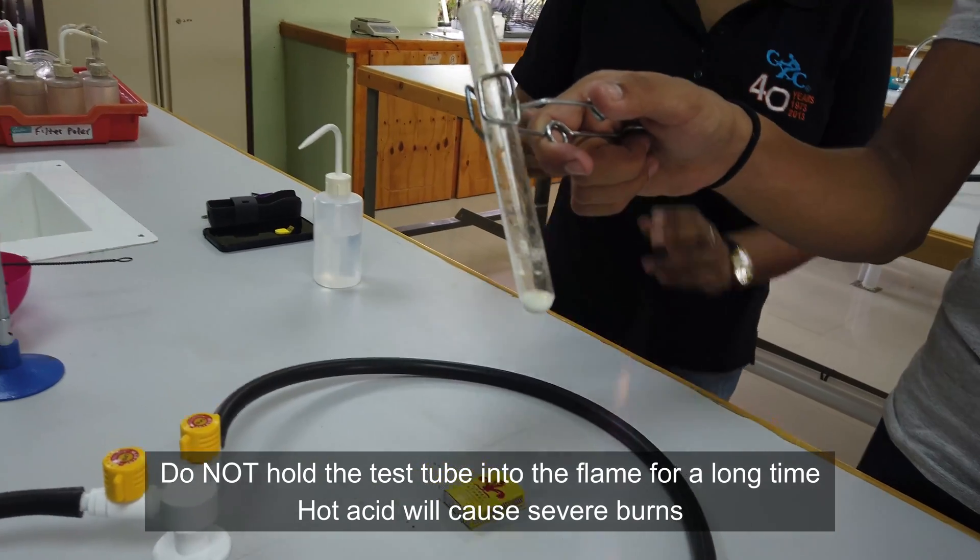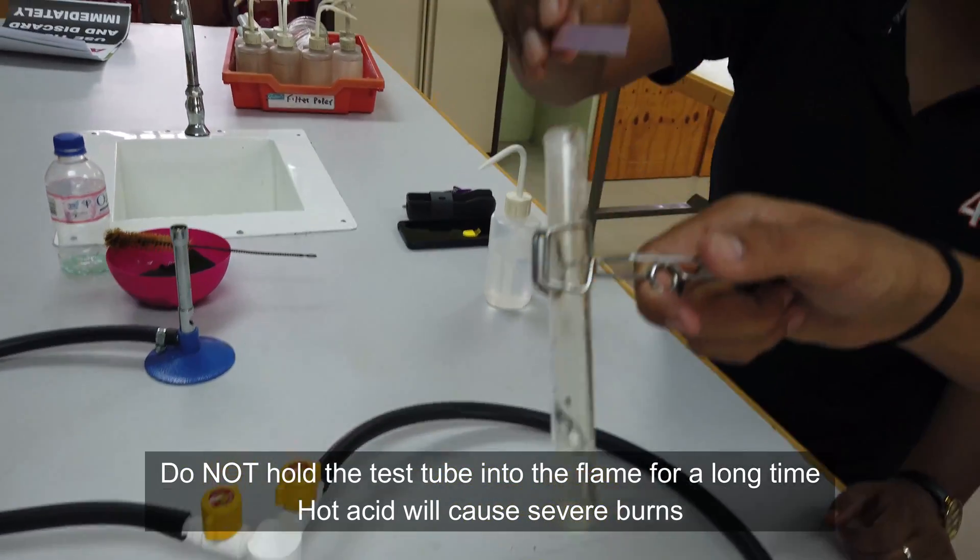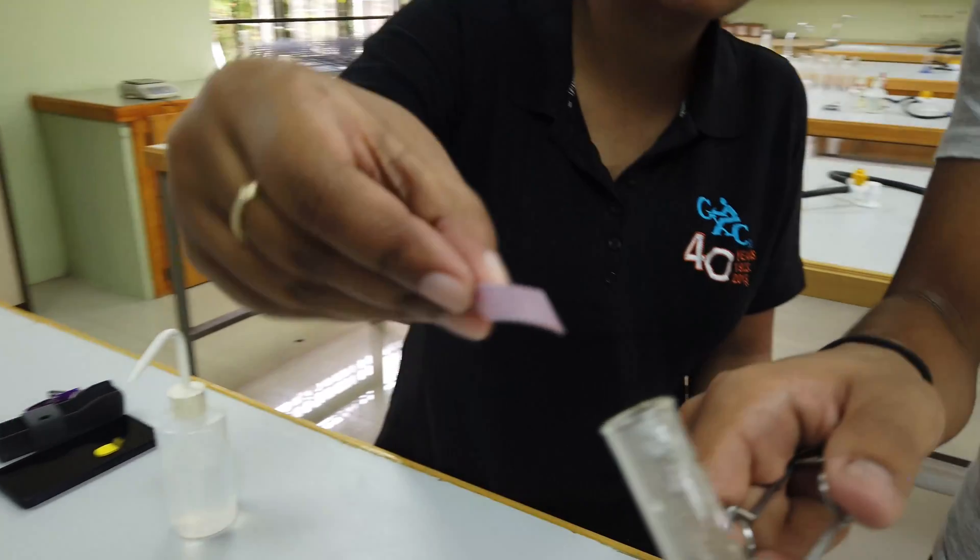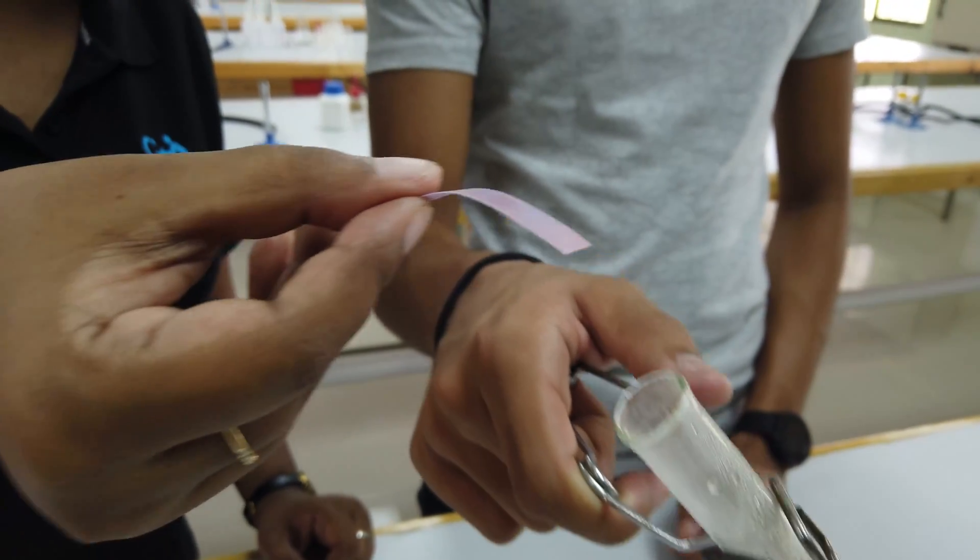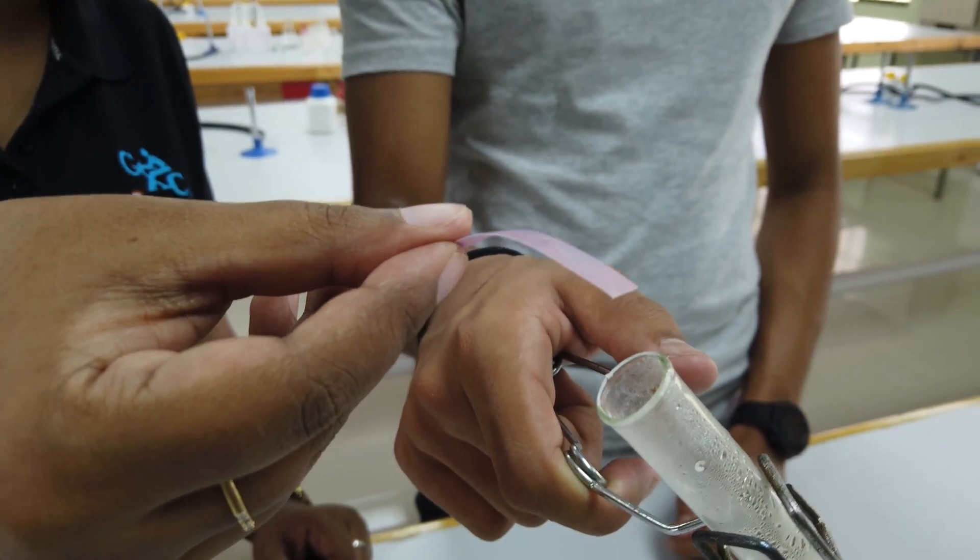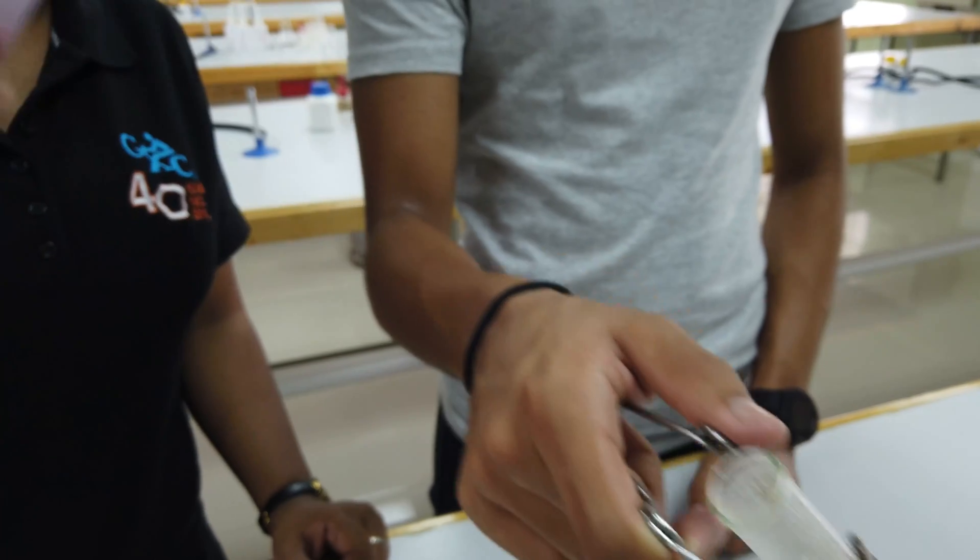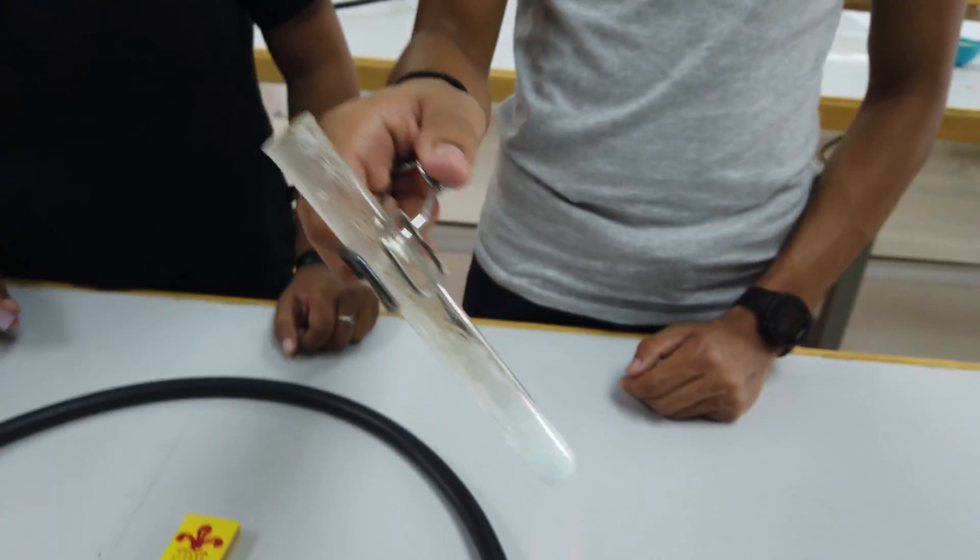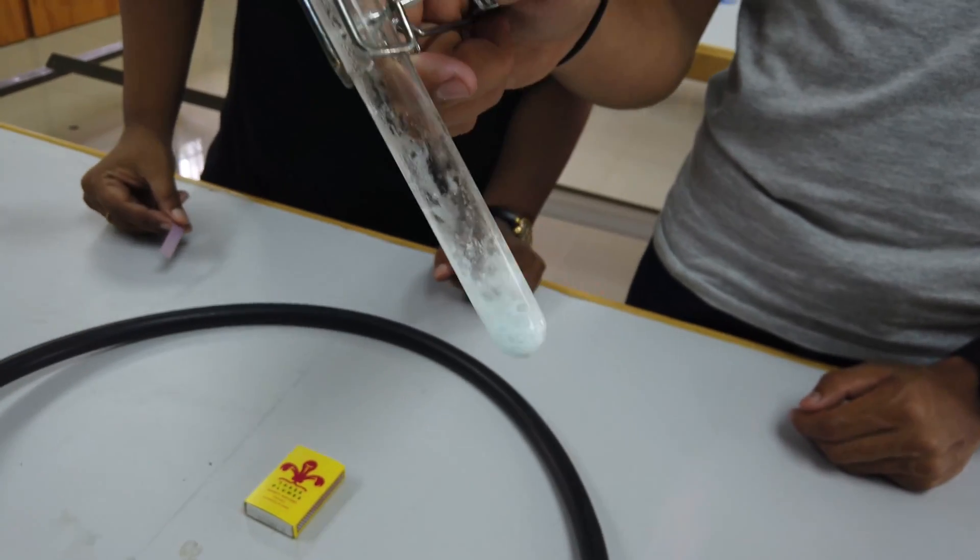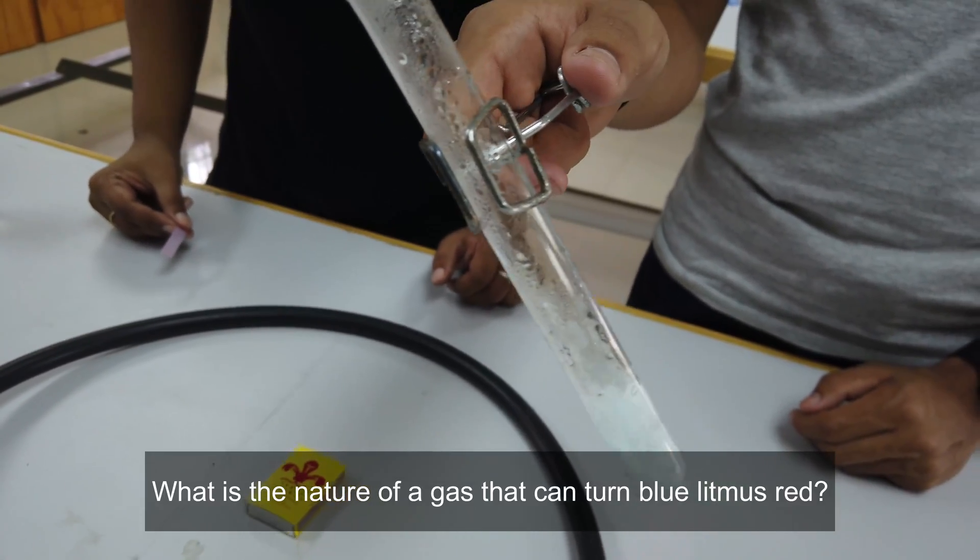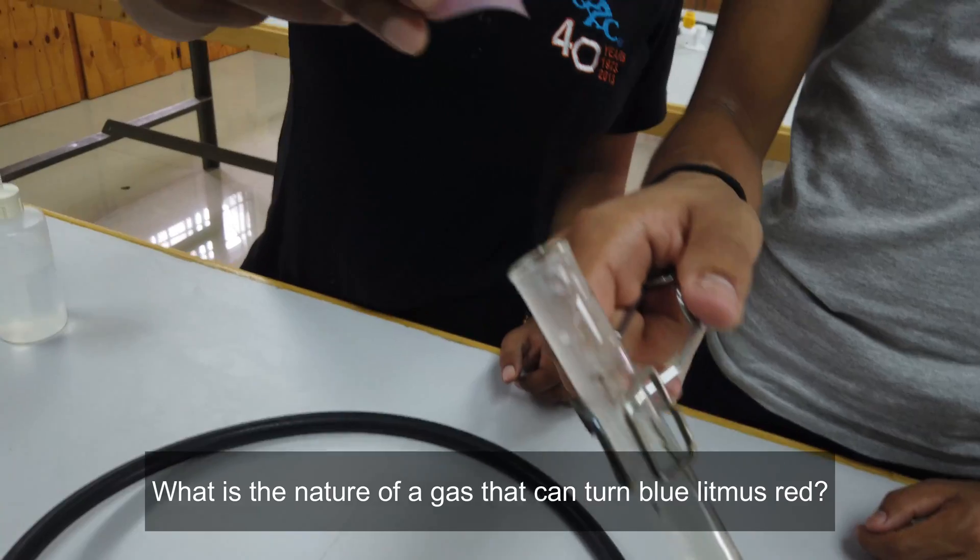What we're going to do is test this gas here with some blue litmus, and notice my blue litmus is already starting to turn pink. All red. What does that say about the gas that's coming off? You have to tell me now.